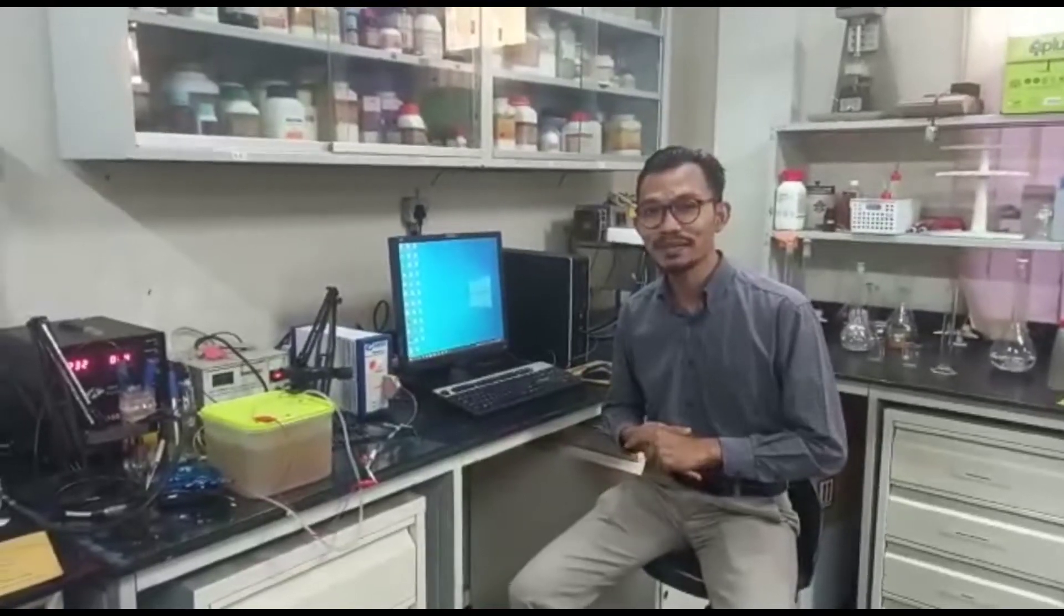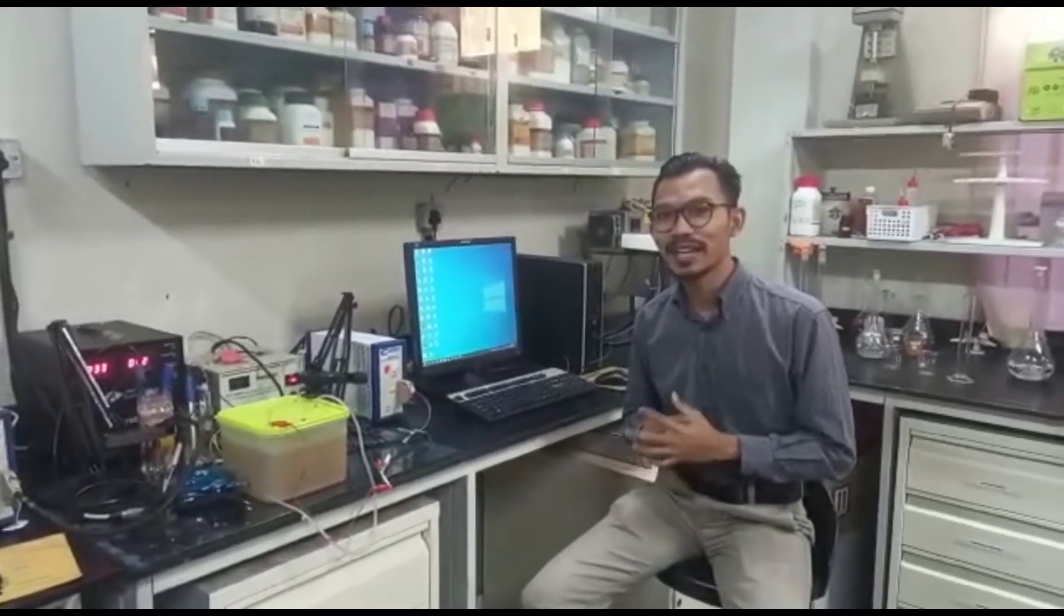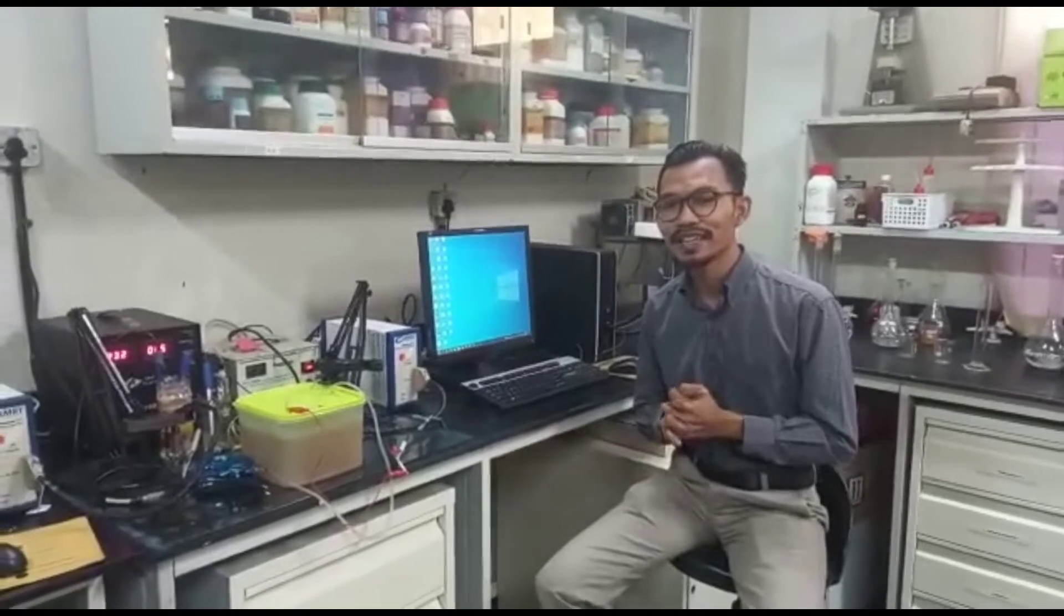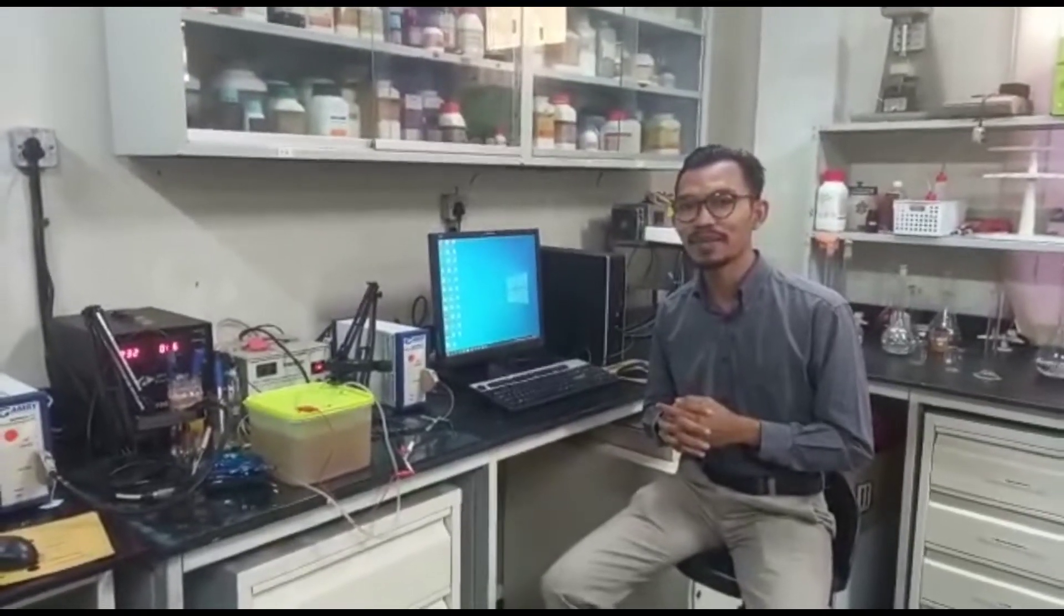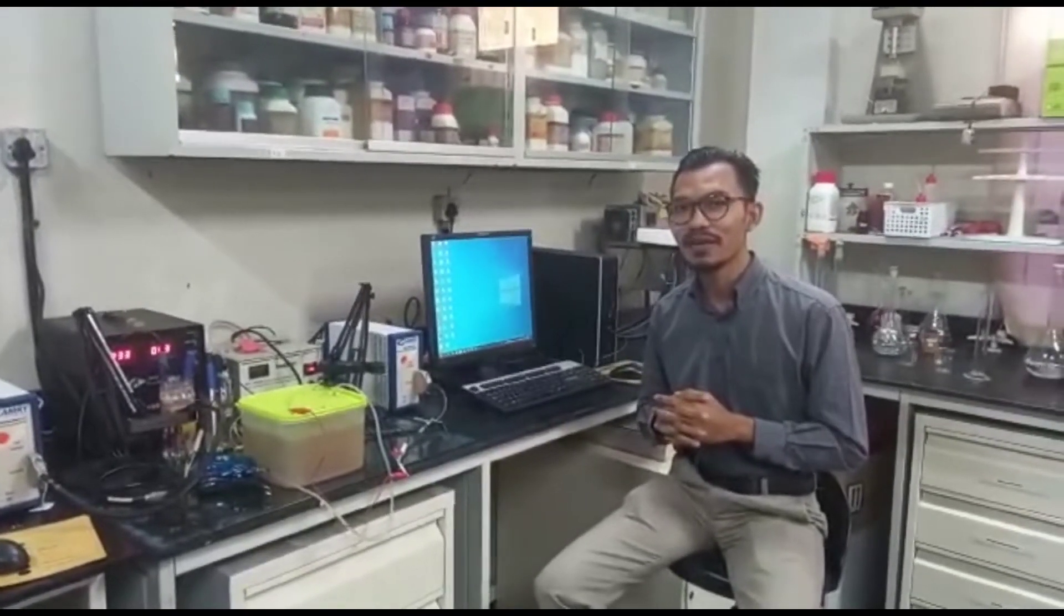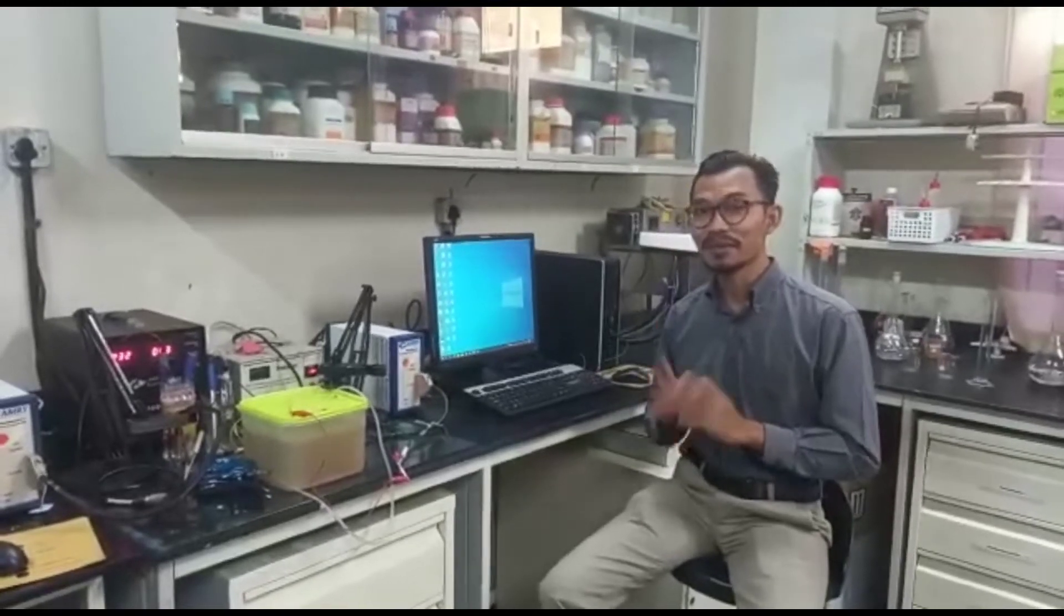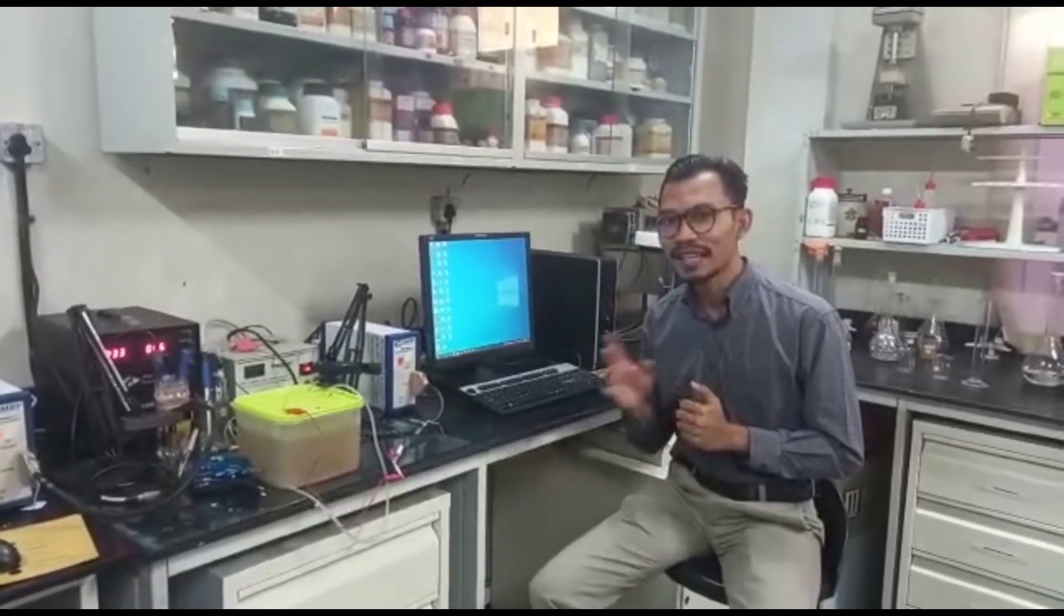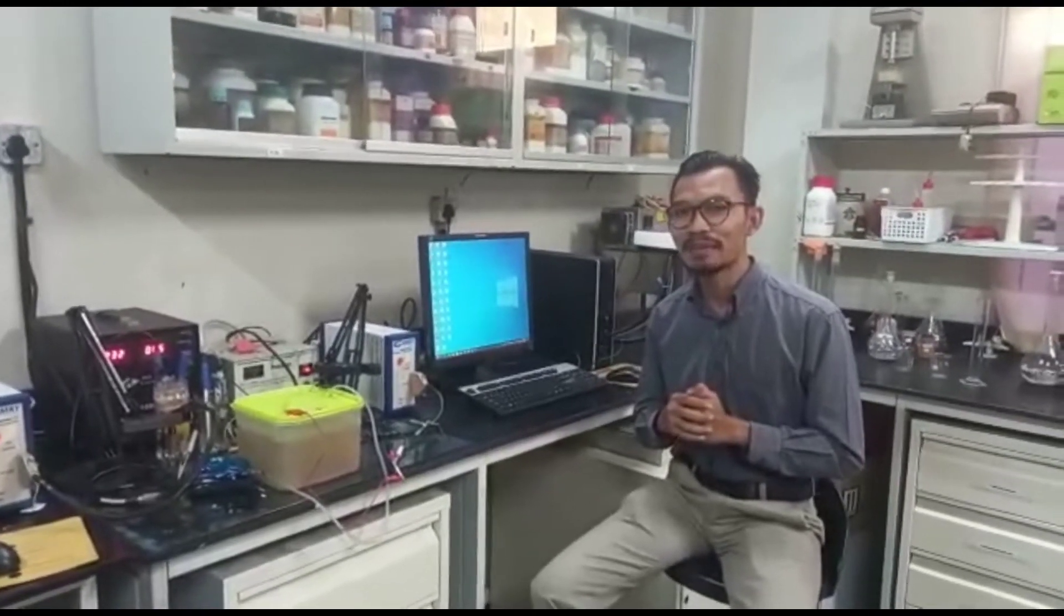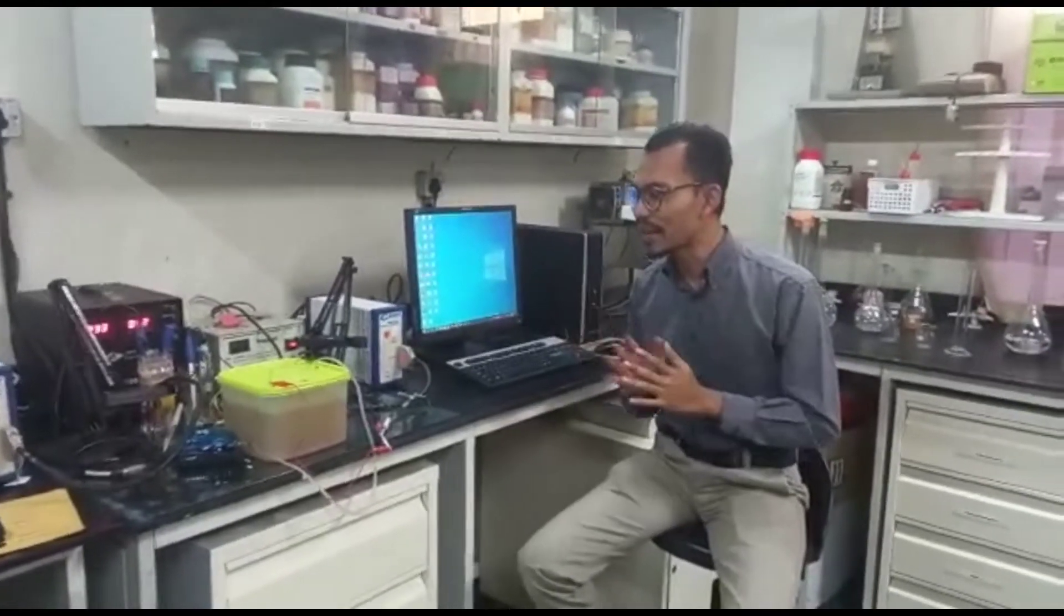I'm Hazwan from USM and today I'm going to show you how we can run Electrochemical Impedance Spectroscopy Analysis for Microbial Fuel Cell. But before we start the experiment, let me just brief you a little bit about the setup.